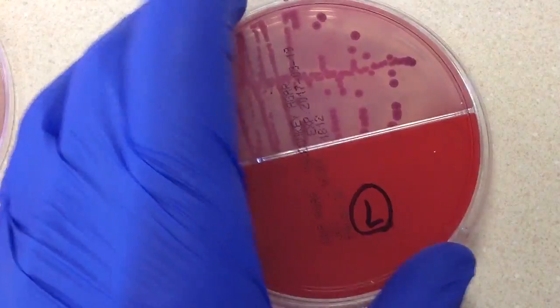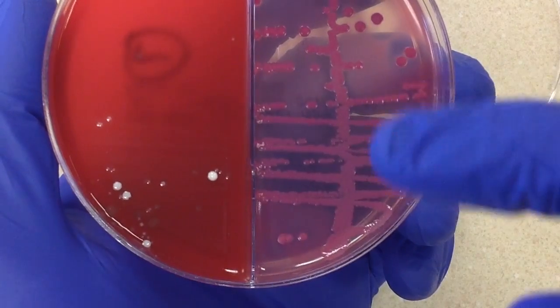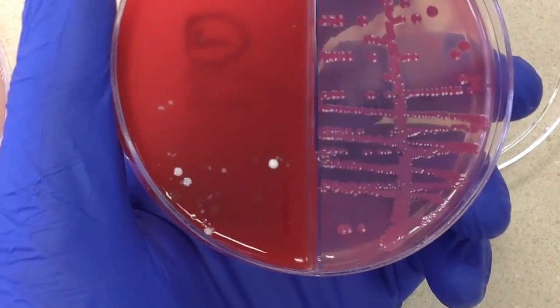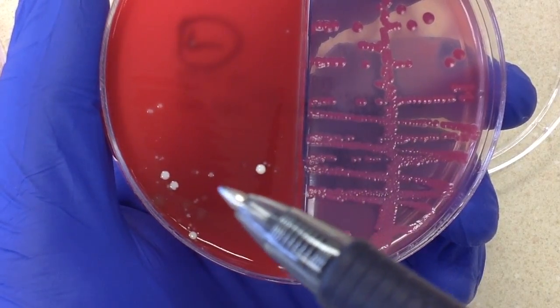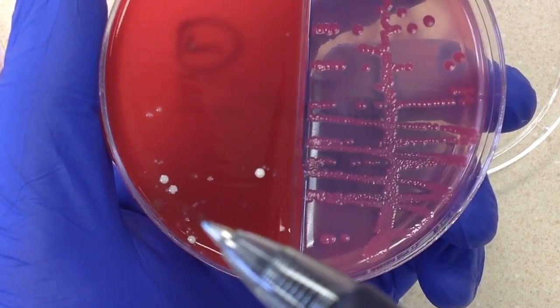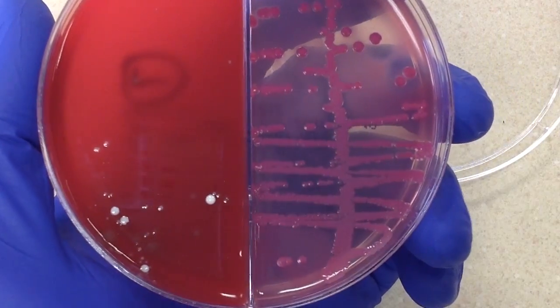Let's go ahead and take a look at our differential, our selective plates. We have a lot of colonies over here on the McConkey's. And I think you can see here that we have one, two, three, four, maybe even five different colony types on the CNA.